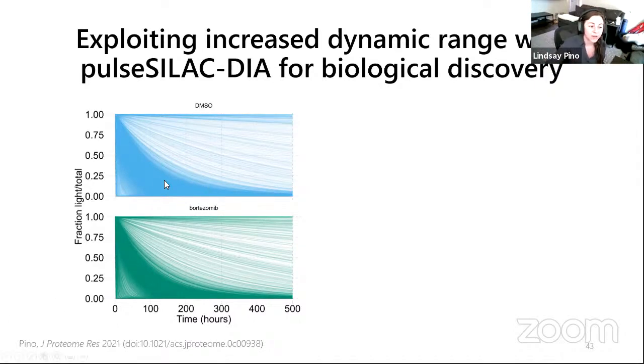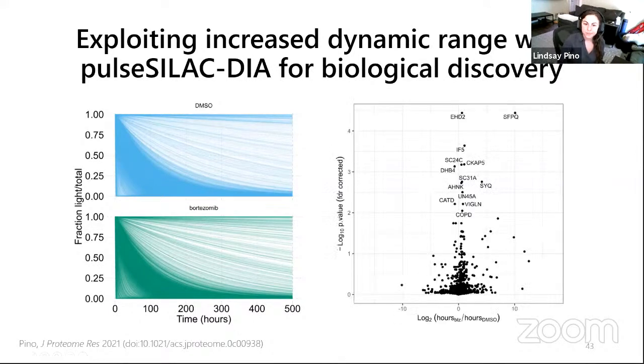You can see the majority of proteins turn over at a moderate rate, maybe about 100 to 150 hours. But we can calculate these actual values by calculating the 50% point, the half-life, in these curves. And when we do that, we can make a pseudo volcano plot out of the differential proteins. This is not a real volcano plot, so I'm going to explain it a little bit.